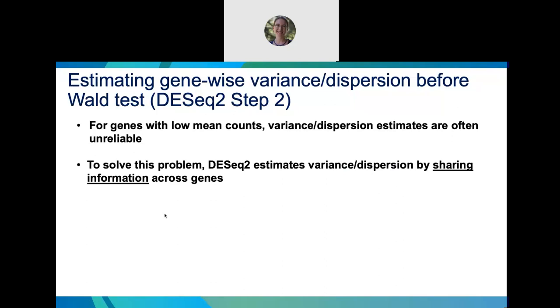So these genes could still be interesting though. These are genes that are not low enough that they've been filtered out through our counts row sums less than 10 filter. They're just low enough that the variance is unreliable. So they're probably still interesting to us.